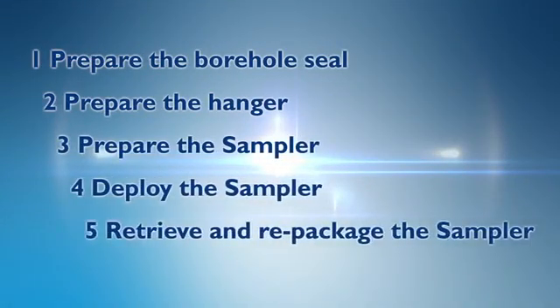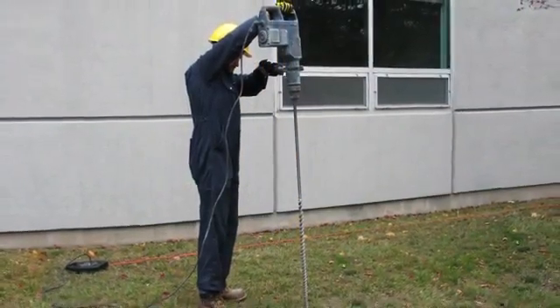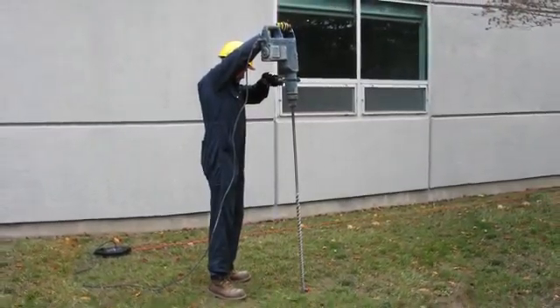This video demonstrates in five steps how to use the sampler to collect soil gas samples for analysis. Using a hammer drill with an auger bit, a hole of up to five feet can be drilled, allowing passive samples to be collected at depths which some regulatory documents require. A soil gas sampling kit can be purchased or, if desired, can be built by the user.